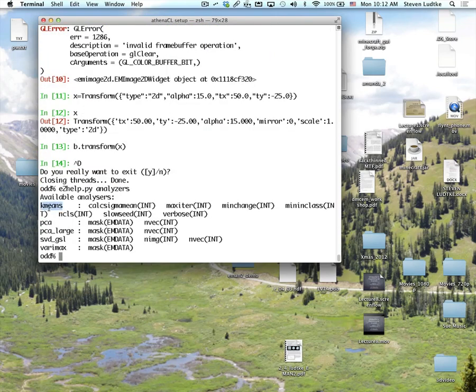So you can see there's a k-means analyzer. Then there are 3 different analyzers which basically do something called principal component analysis, and then there's something called Varimax, which is related to principal component analysis. PCA, if you've ever taken a class on ProbStat, something like that, is a statistical analysis method which was first developed by people, basically accountants, for the insurance industry.